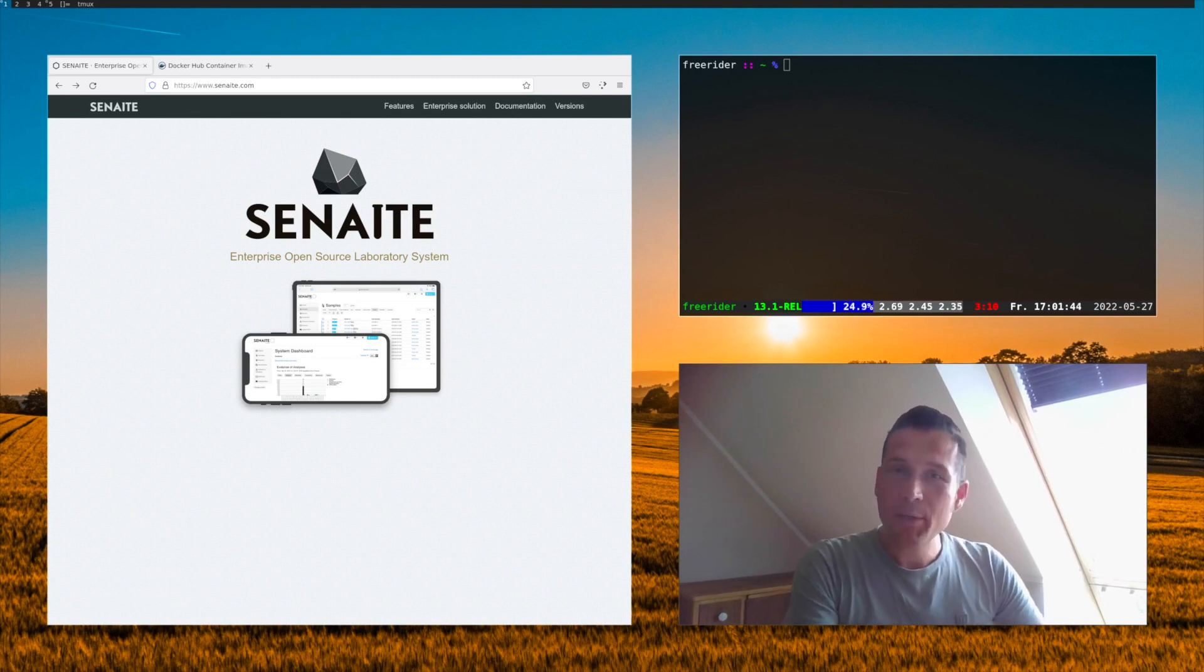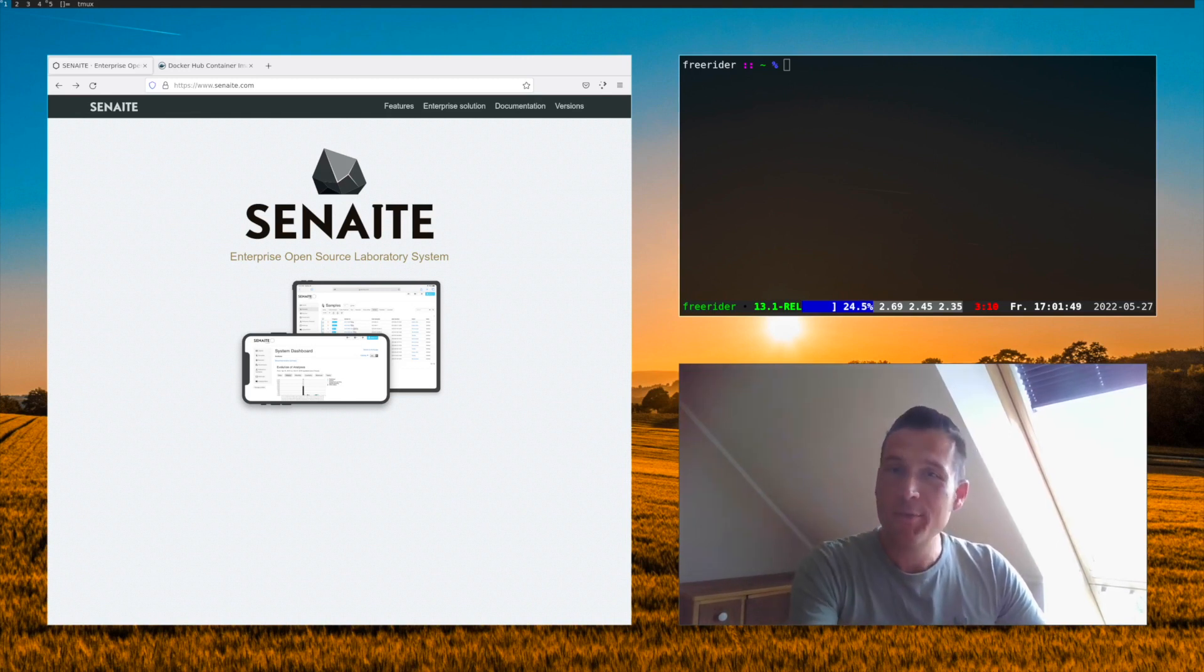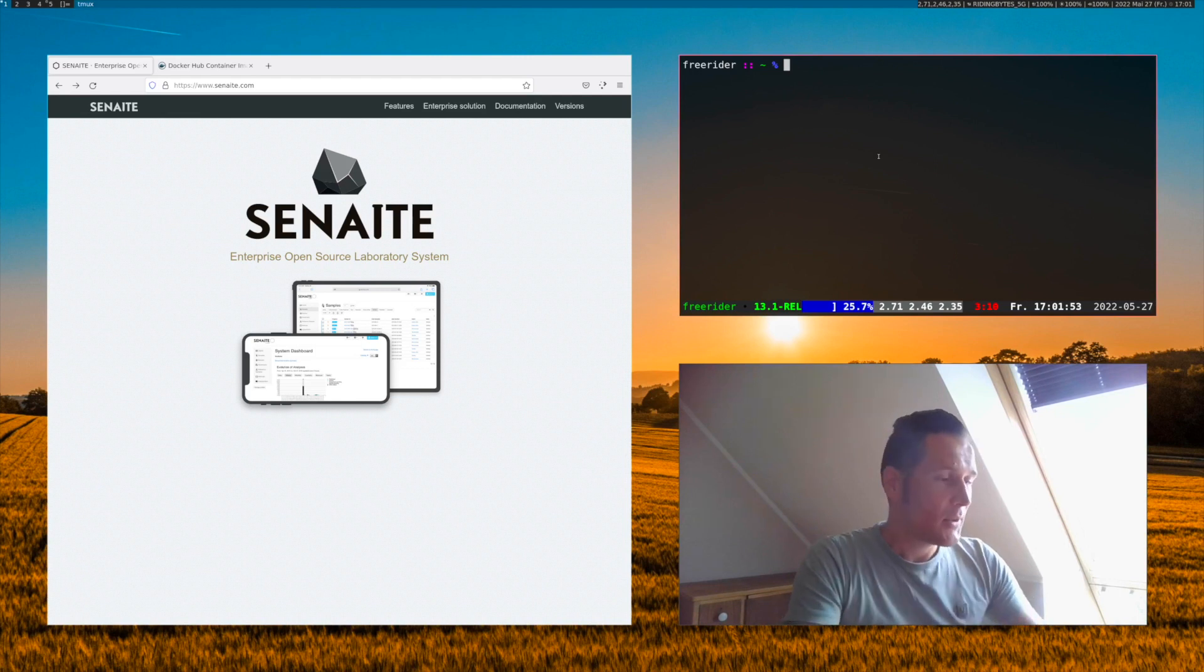Everything you need to have is a computer with Docker installed, a terminal, and two simple commands. So it is really easy. Let's start.